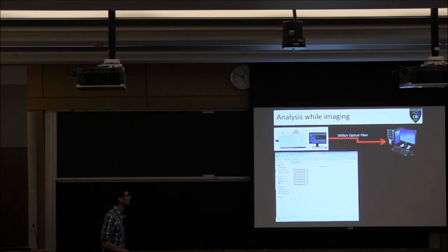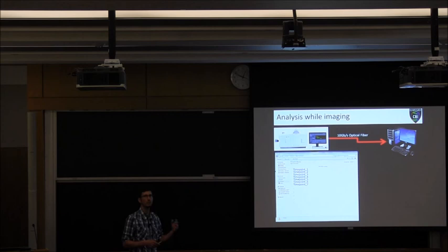Another example is Zen Black now does this as well for Airyscan data. So if you're doing an Airyscan acquisition with multiple time points, if you send that data to one of the workstations outside my office, you can start doing the Airyscan processing as each time point arrives, as opposed to having to do it after you've acquired it.